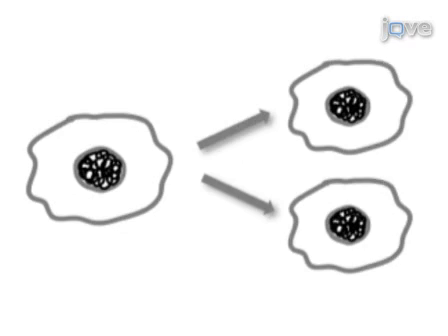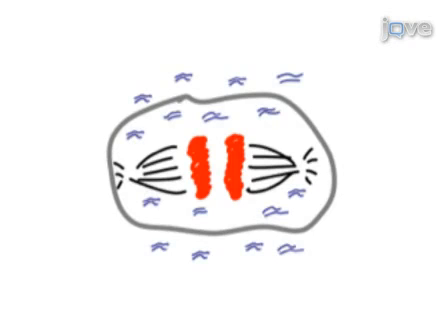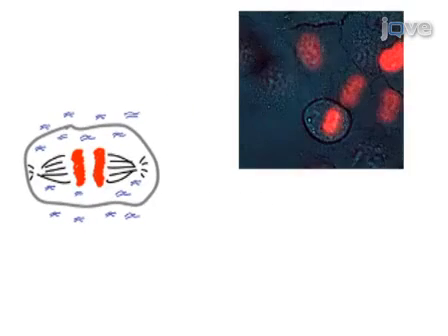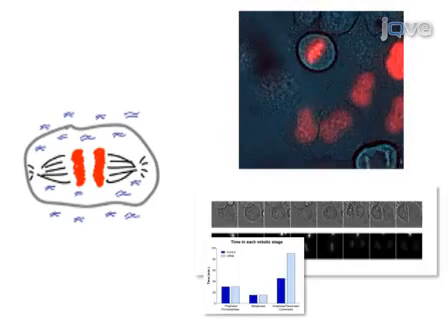Changes in cellular organization and chromosome dynamics that occur during mitosis are tightly coordinated to ensure accurate inheritance of genomic and cellular content. In this video article, a method for tracking hallmark events of mitosis is shown. Chromosome movement is monitored on an individual cell basis using cell lines expressing fluorescently tagged proteins. Transfection with siRNAs directed against mitotic proteins results in cell cycle changes that can be visualized by time-lapse imaging and quantified by image analysis.